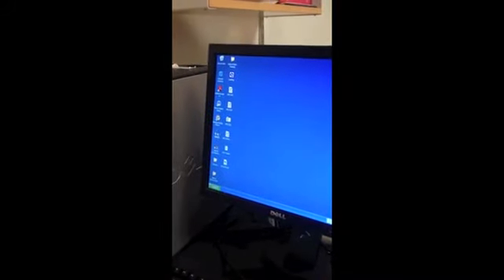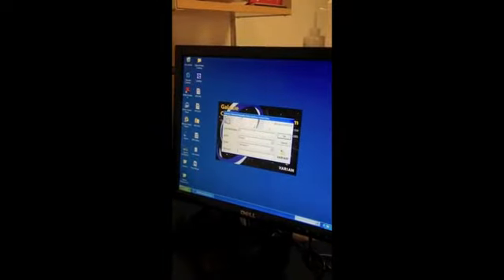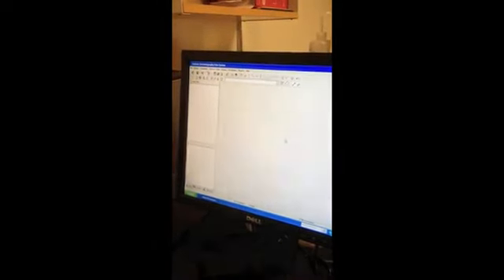Now going over to the computer and turning on the program. Click on the galaxy icon, click OK. There's no password needed. Down here you'll see data, systems, calibration. Click the systems tab. Then it will have HPLC system with an empty box next to it. Check that.